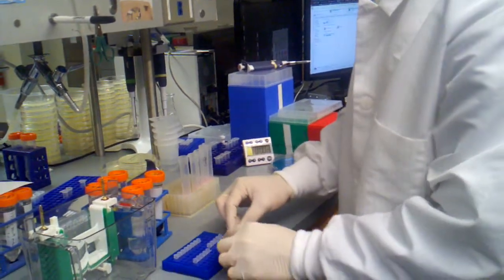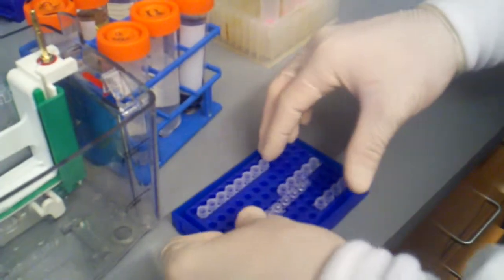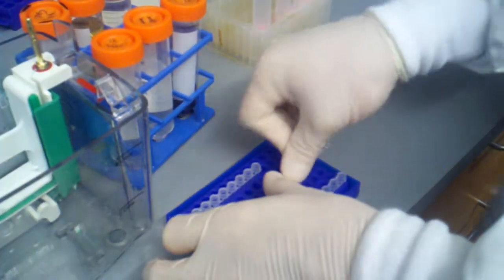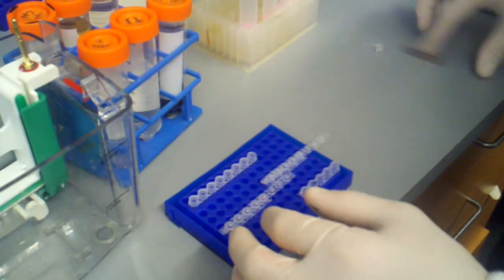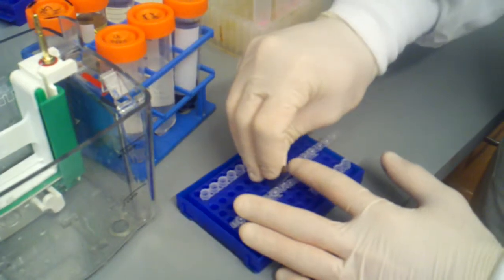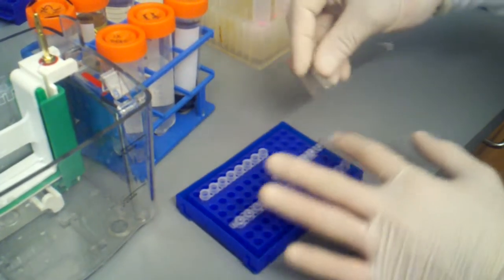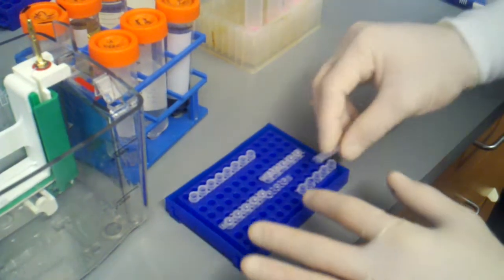First, I'm going to move this out so I can cap them. And I'm going to cap. Have a little bit of excess cap there. I'm going to chop that excess cap off of the razor blade. I should cut away from myself, I guess. For all the Boy Scouts out there. And cut off there.